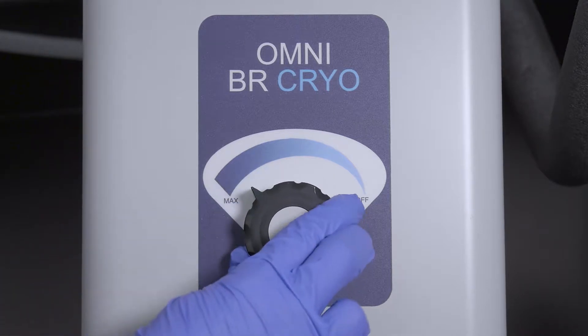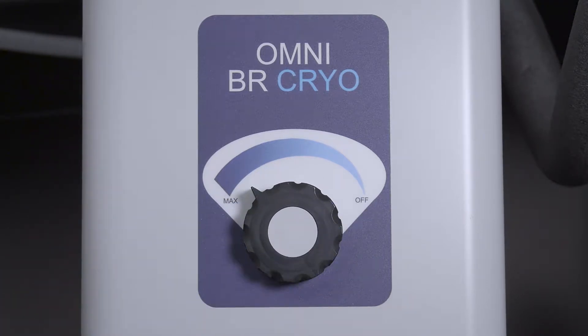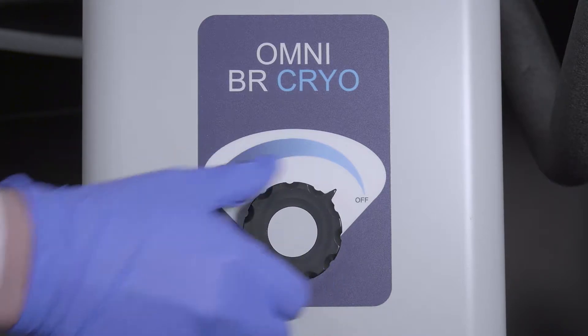Run dry air at the max setting for 30 seconds to purge the air lines. Return the control knob to the off position.